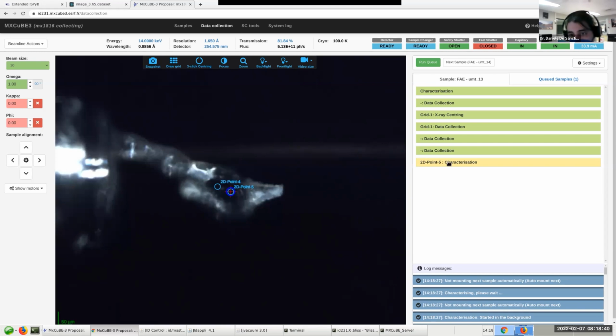So you see that here the characterization is still yellow because it's still running. It says characterizing, please wait. So I'm going to show you 2 other things.